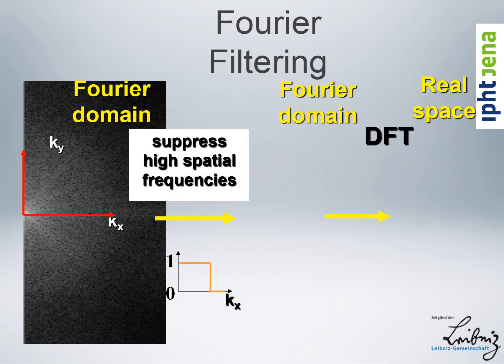So why is that important? Well, remember back, we were talking about the optical transfer function in Fourier space and the point spread function, the picture drawing with the brush operation, convolution, in real space. And of course, this is what's going to happen in Fourier space.